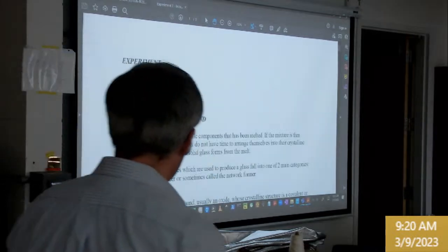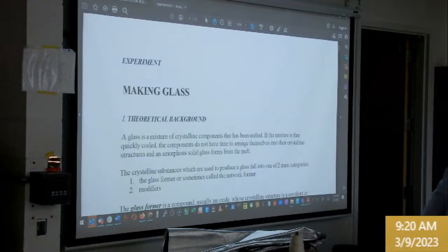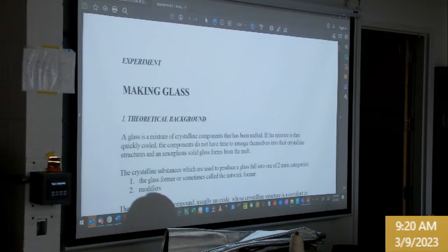All right, so once things get rolling, this will progress fairly quickly because we've got only 5 glass batches and we typically pour 10. So even though we're getting a slightly later start, you'll still get out ahead of schedule. That would be the most likely plan here.